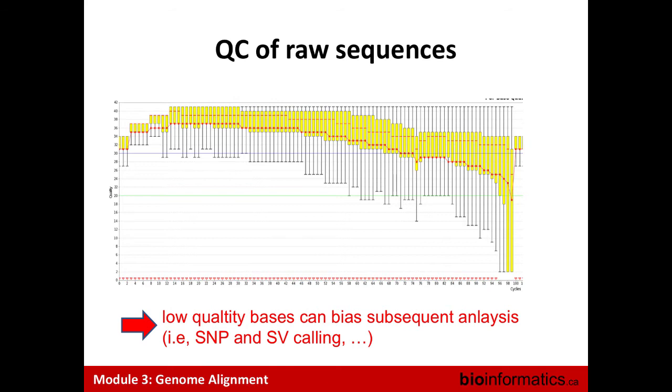Yeah. So if you have a BAM file, you can just use something like Picard or GATK to do SAM to FastQ, and I think some other tools are also able to do that. So to go from SAM to your FastQ, and then you can generate the graph.